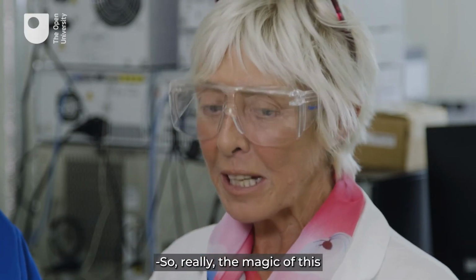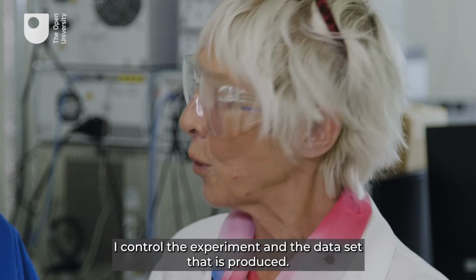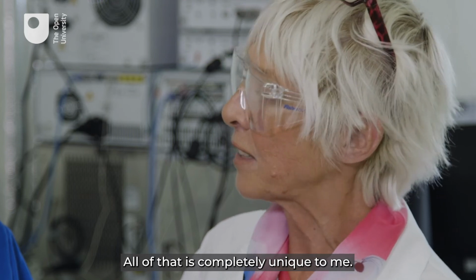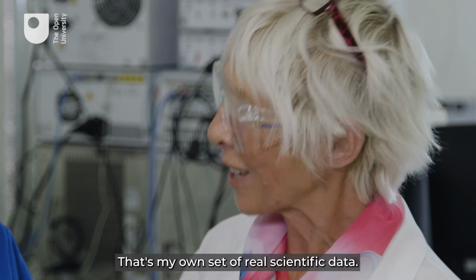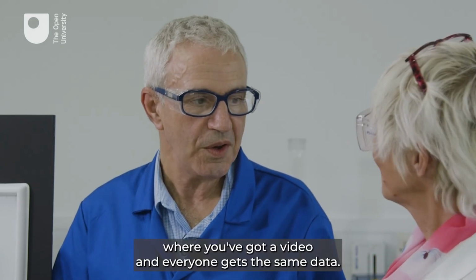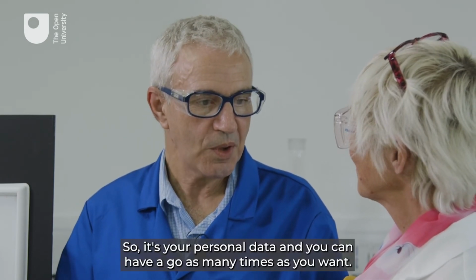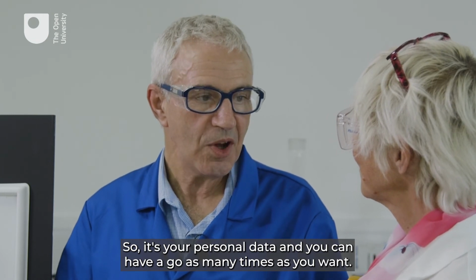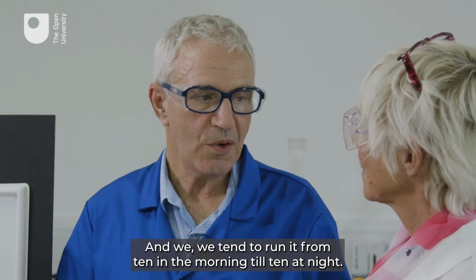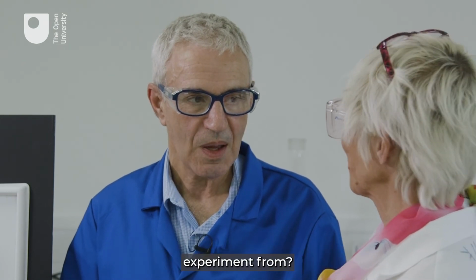So really the magic of this is that as a student, I run the experiment, I control the experiment, and the data set that is produced is completely unique to me. That's my own set of real scientific data. Yes, that's correct. So it's not like a simulation where you've got a video and everyone gets the same data. So it's your personal data, and you can have a go as many times as you want, but there is a booking system. You can't just do it any time, and we tend to run it from 10 in the morning till 10 at night.